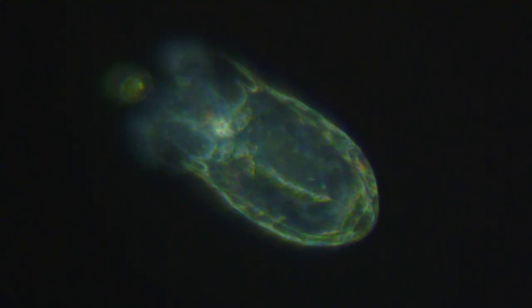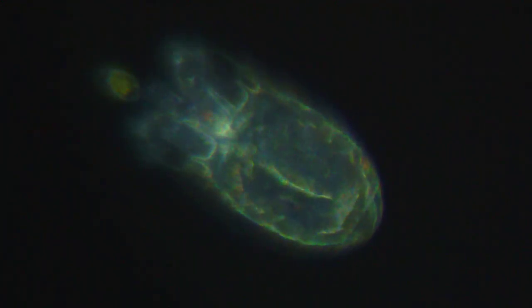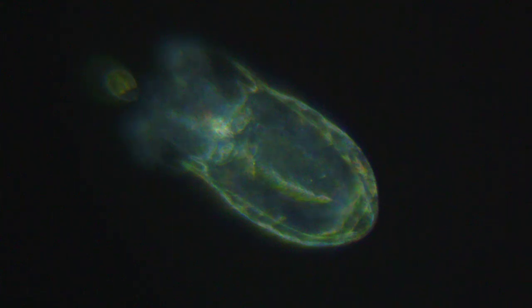So yeah, this is the closest I've ever seen a rotifer under this microscope. You can see his little insides moving around. I don't know what he's doing there. Digesting? Who knows? He's still spinning his little rotifer wheels. Looks like he's trying to eat that algae. It's not really moving.